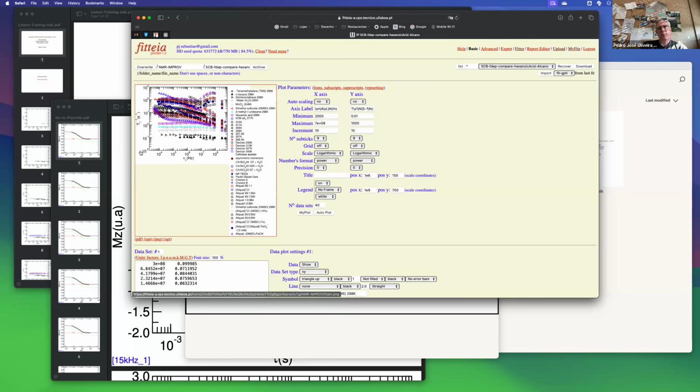But it's possible to make field cycling measurements at these frequencies. We just have to compensate well for the Earth field and any other fields or artifacts that might show up at this low frequency range. And with respect to the relaxation rate accessible, I showed you from TMS, which has a very small relaxation rate, to relaxation rates of about 1,000. You see all the dispersion profiles fall here.